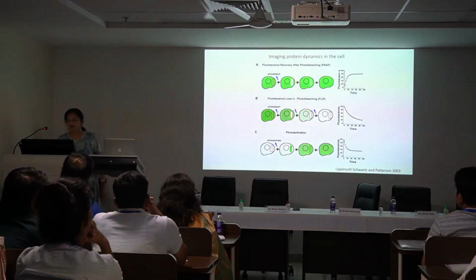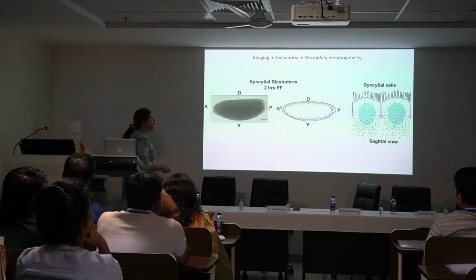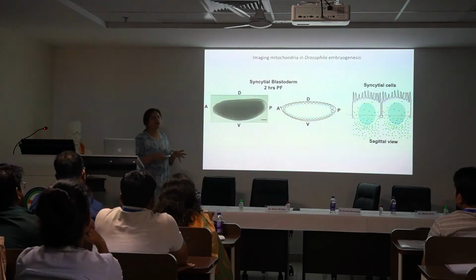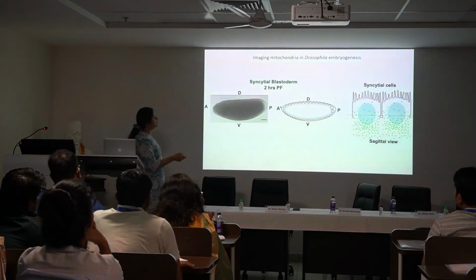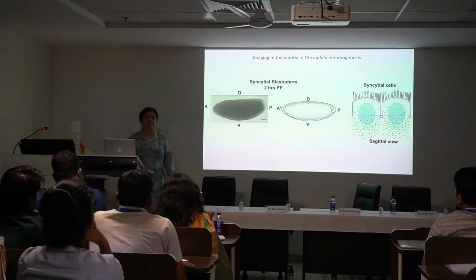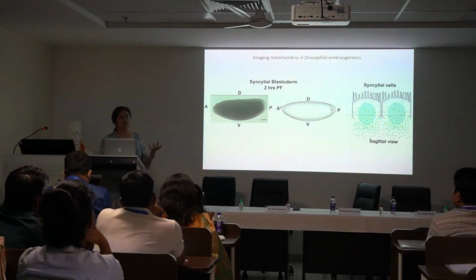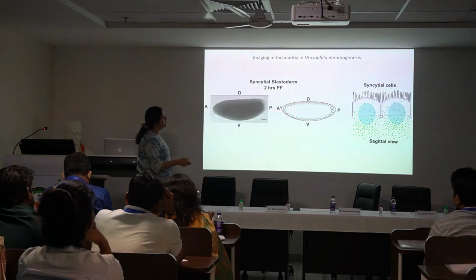Okay. So anyways, first I'll show you one application of photoactivation which we have done, and hopefully you appreciate how it can allow you to look at very crowded systems. So one of the other interests we have is in studying mitochondria and embryogenesis, right? So mitochondria are this powerhouse of the cell. They are organelles which allow for giving ATP for these different cells and so on.